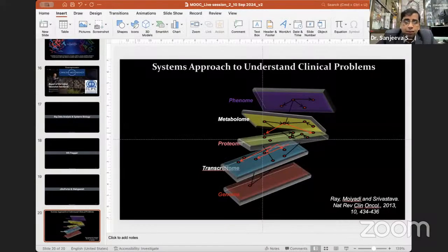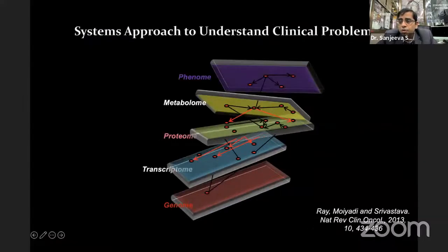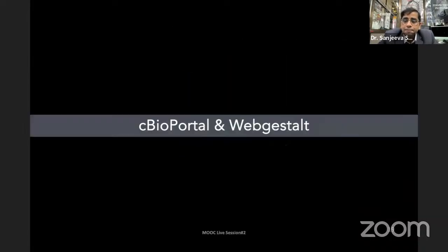Earlier, we used to look at different software to do the plotting of the data, like MS-Fragger, MetaboAnalyst and Perseus, many other software. But now you have the advantage that you can use MSFragger and generate from the same software, and you can look at very simple output as well, and very fast. Additionally, you can always do more proteogenomics data analysis with cBioPortal and WebGestalt.